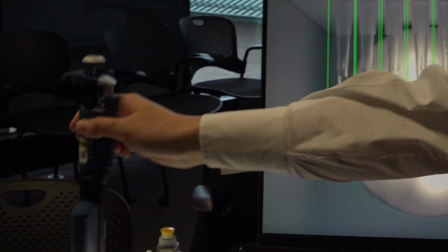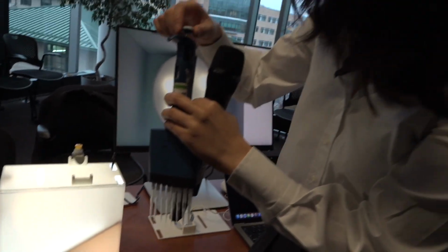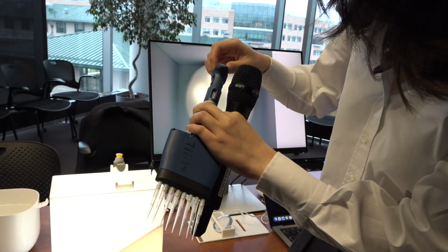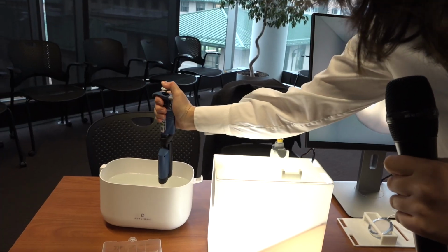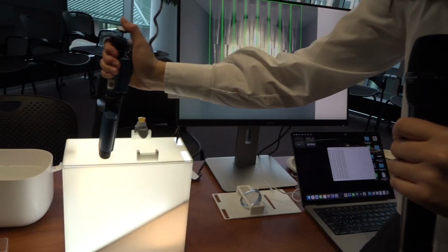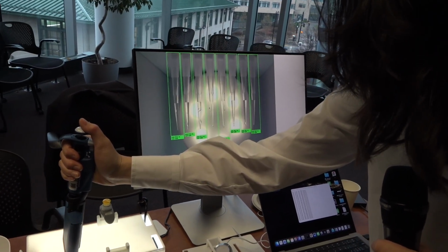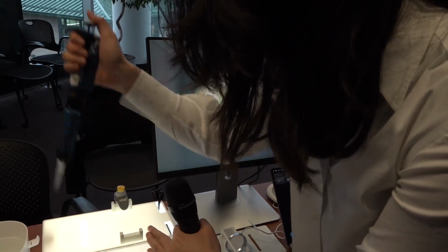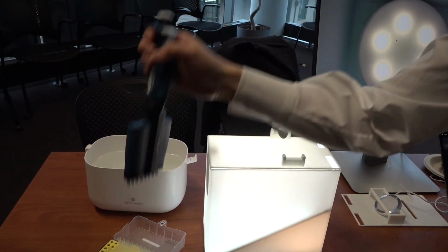Let's try a different volume, shall we? If you remember how to use the pipettes in high school, maybe. Let's try 29. Okay, aspirate. Oh, it's pretty good. It's actually 27, 28. The middle one isn't really good. It's too overexposed, and I've written that in my future work.